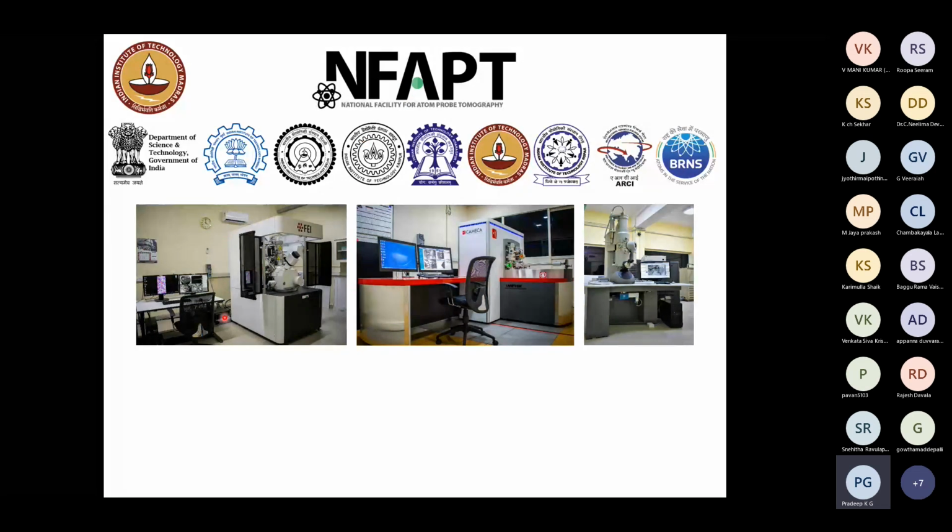So the leftmost one is the dual beam focus ion beam, which we utilize to produce the samples necessary for the atom probe tomography, which is the middle picture here. So this is the most advanced microscope that we have. And to support the functioning of this facility, we also have what is called a transmission electron microscope. That means in the dual beam microscope, we will be able to produce samples necessary for transmission imaging, or we can do, to a large extent, transmission imaging inside this dual beam microscope itself. And we produce the sharp needles, which is necessary for this atom probe tomography.